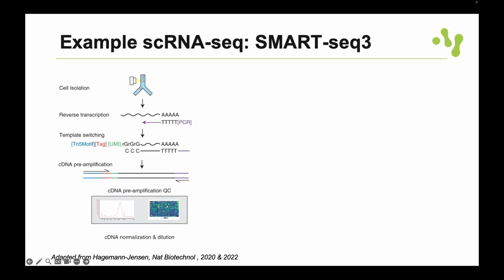Another thing is that previously the library preparation part was much, much more expensive. Now it has switched a bit. Maybe it's worth sequencing and checking a subset, but maybe not going for the full big project before you have nice data. Did I answer your question?